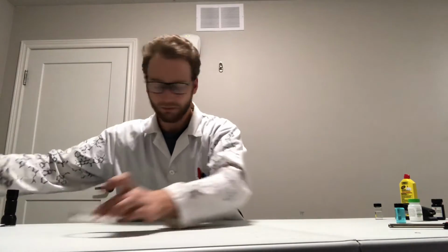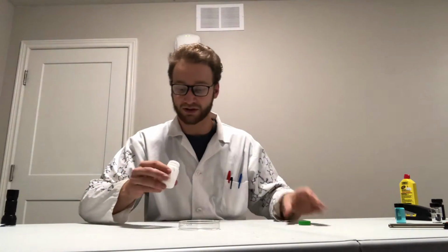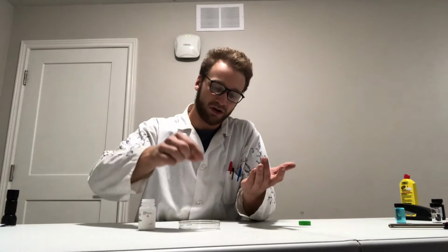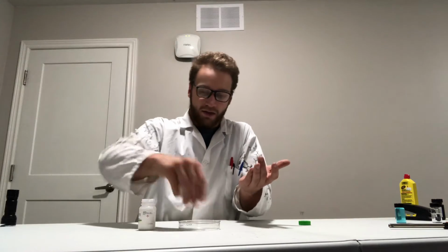So, here I have a petri dish. In this petri dish, I'm going to put a little bit of rubbing alcohol. This is 95% ethanol I got from the store. Now, when we put some salts in it, let's say lithium salts as before discussed, lithium salts burn a nice red color when their electrons get excited. So we're going to sprinkle a little bit of our lithium salt into our solution, and then I'm going to turn off the light, and we're going to light it up using our handy dandy lighter.